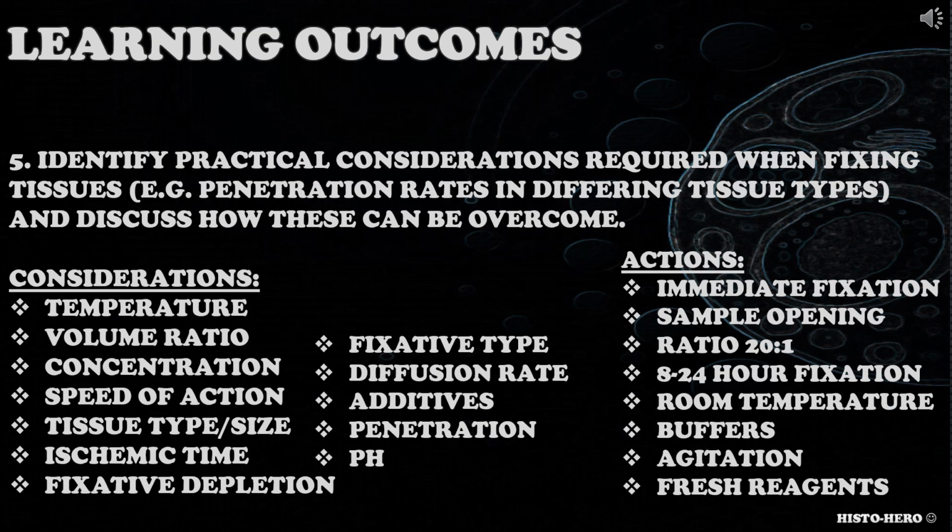How could they be overcome? Consider choosing the right fixative, immediate fixation, appropriate duration of fixation, ratio of 20, sample opening or slicing to allow fixative penetration, room temperature, gentle agitation, use of buffers and so on.